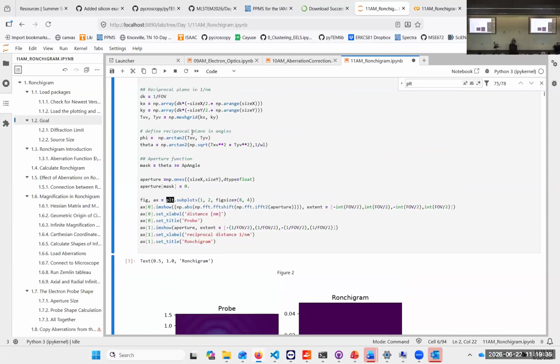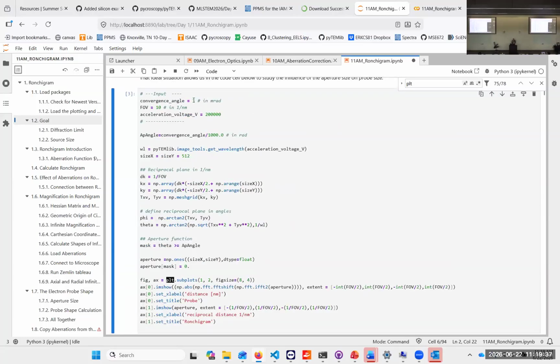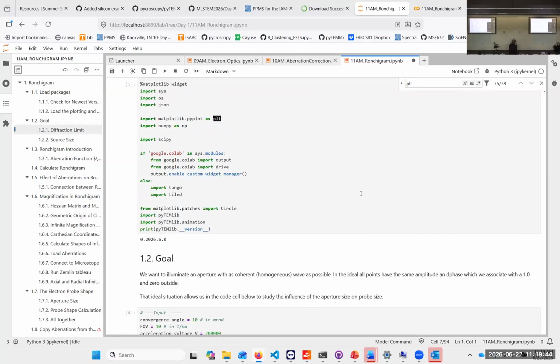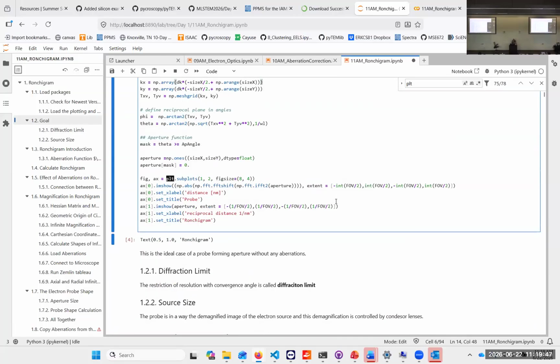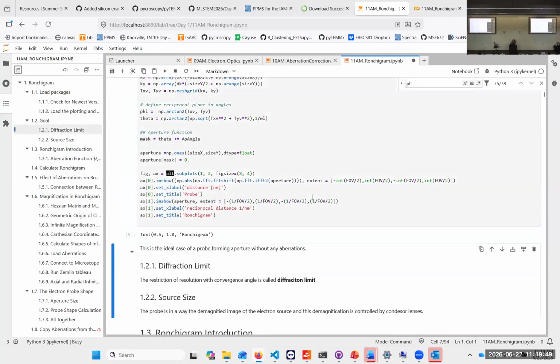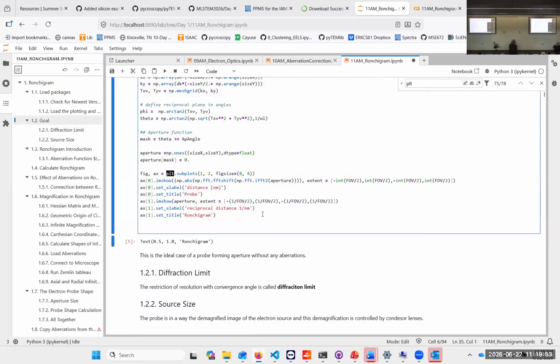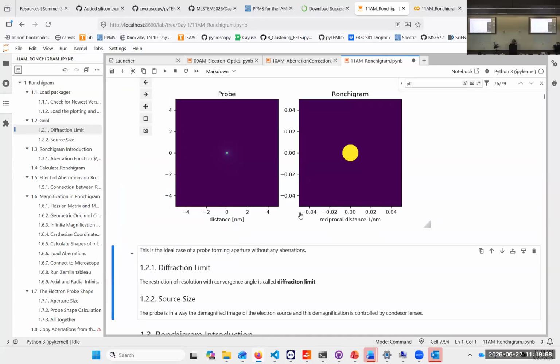Now, if we open that up, this is the same problem. Okay, that solves it sometimes. So we open that up. That means we get more electrons in there.